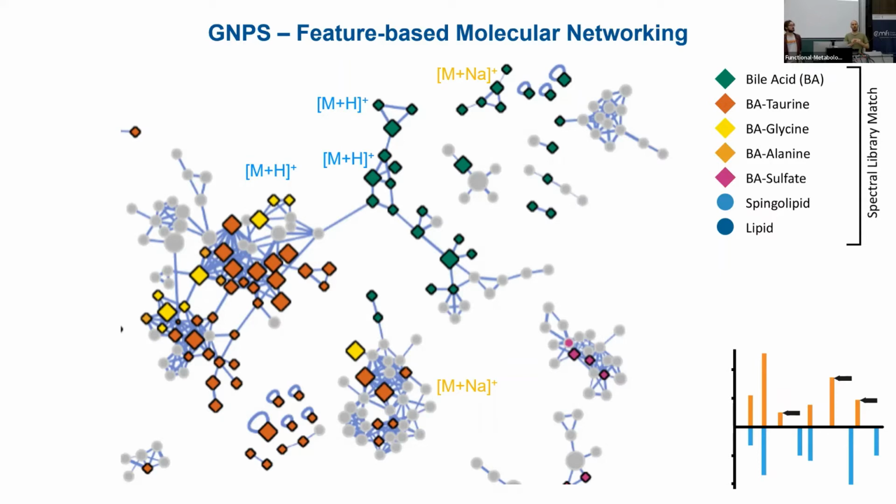For the intro, we saw that this is next level and might be too complicated, but you will see if you watch some of Robin's tutorials for MZmine 3, it's very easy to just set this on as next steps. So this is called ion identity molecular networking. And basically it brings together this kind of artifacts, what we see here, right? So this is kind of the perfect example.